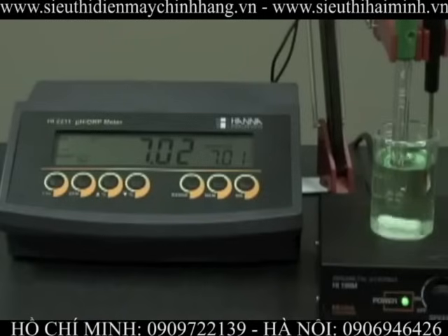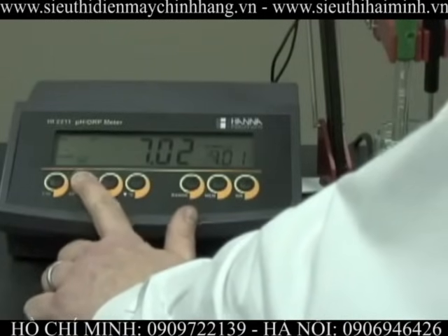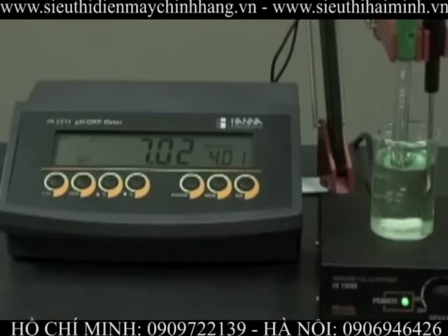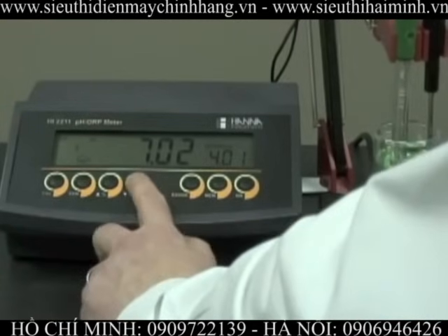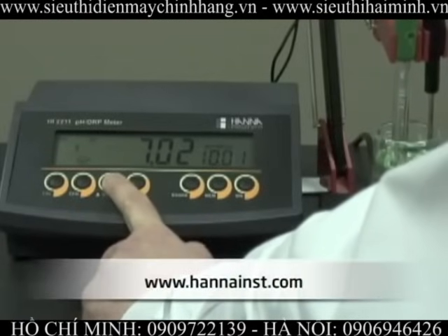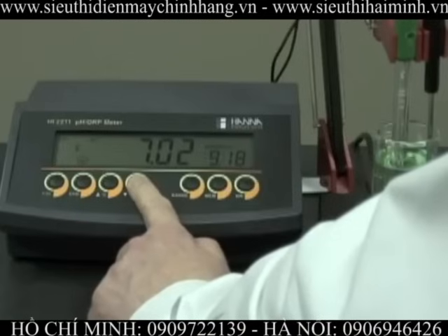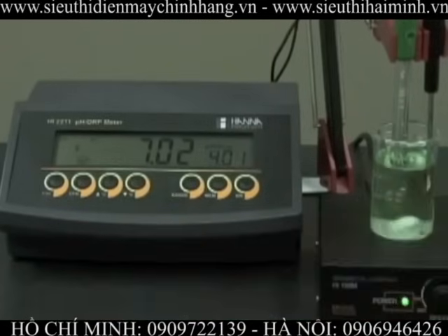Now that the reading is stabilized, CFM is displayed and we hit the CFM button. This now prompts us for pH 4. We can also use pH 9 or 10. In this case, we're measuring a sample in the acidic range, so we'll use pH 4.